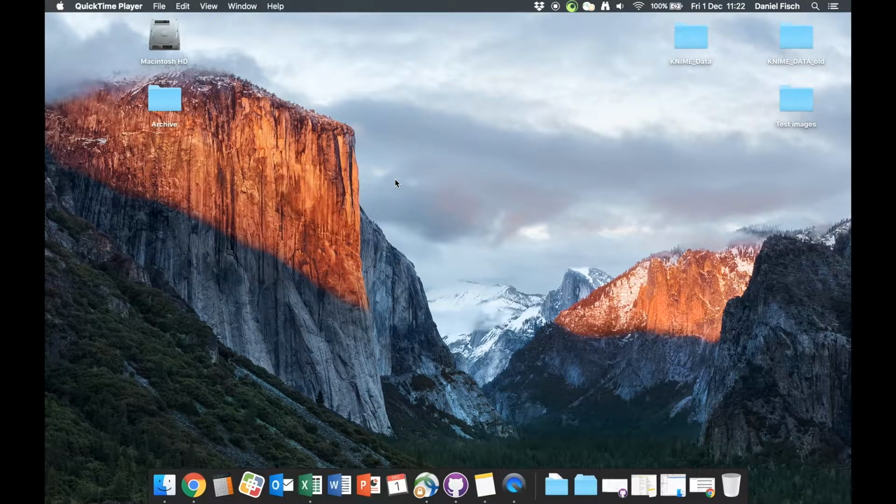Welcome to the first video in our series of tutorial videos that will show you how to get HRMAn to work on your computer and how to use it for your experiments. In this first video I'm going to show you how you can install KNIME on your own computer and how to load HRMAn into the local workspace.